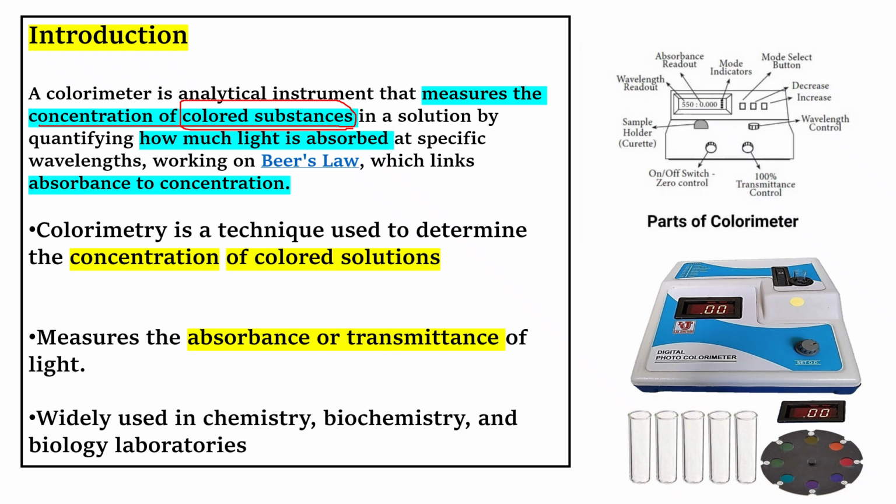Now, Beer's law is the law which connects the absorbance with the concentration. Beer's law was given by the scientist Beer, that is why it is called Beer's law.